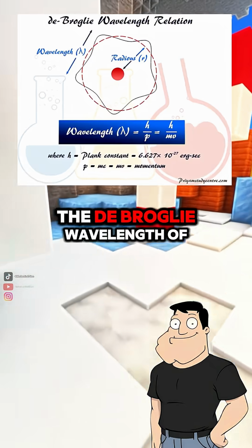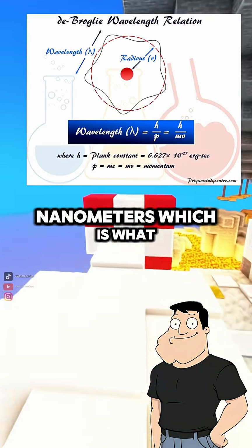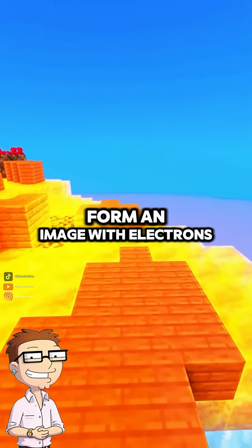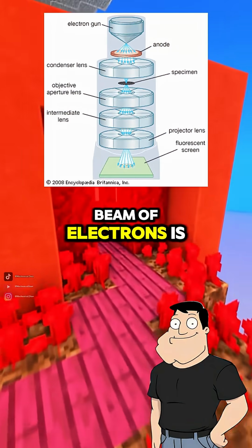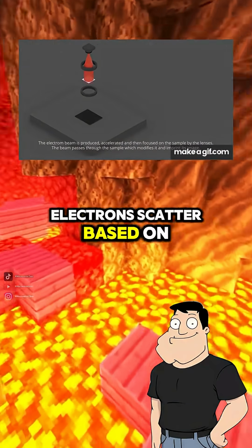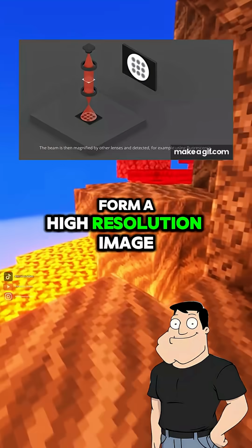Exactly. The de Broglie wavelength of a high-speed electron can be under 0.01 nanometers, which is what allows you to see at atomic scales. So how do they form an image with electrons? In a transmission electron microscope, or TEM, a beam of electrons is shot through an ultra-thin specimen. Electrons scatter based on the material's structure, and detectors measure that to form a high-resolution image.